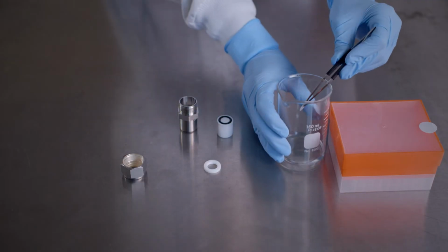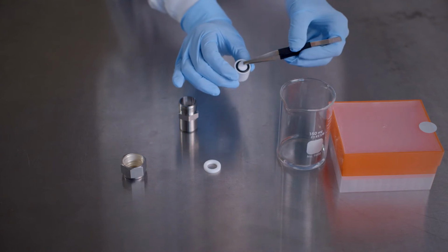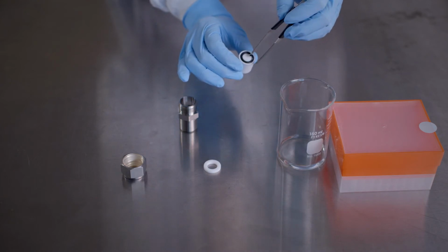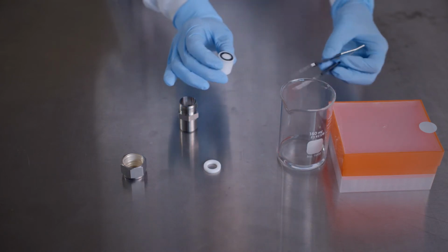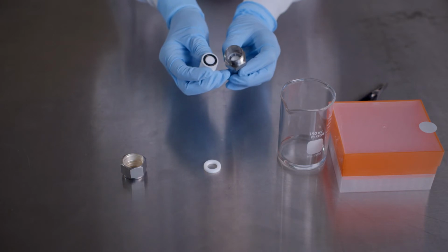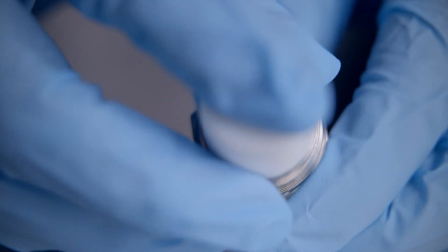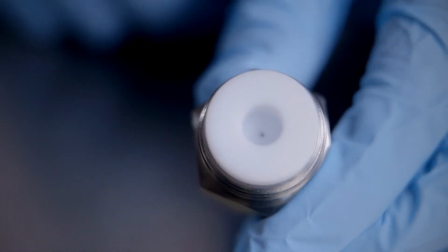Now we're ready to add our remaining pre-wetted filter support to the Teflon orifice on the inner diameter of the O-ring of our remaining internal membrane support. Now we will add this internal membrane support to the extruder outer casing, this time with the O-ring pointing downward, being careful not to twist the internal membrane support as it comes in contact with the polycarbonate membrane.